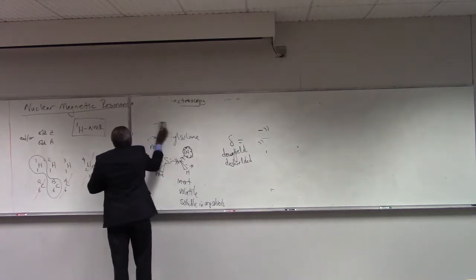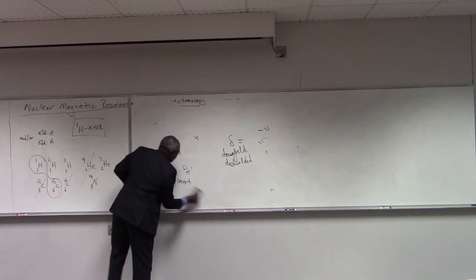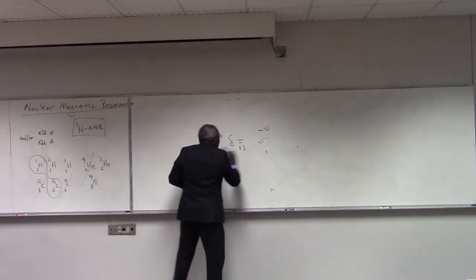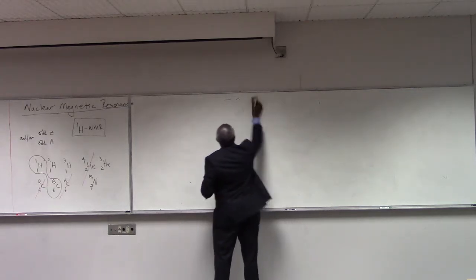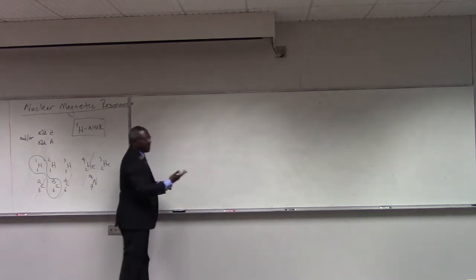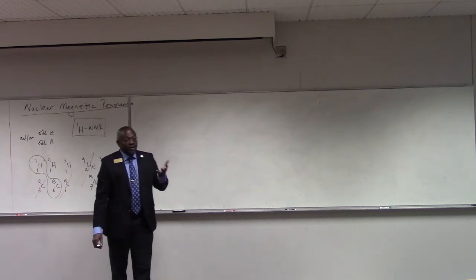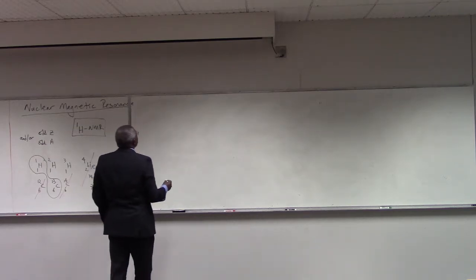So when we look at an NMR spectrum, we look for four things, although I will mention all four. For the purpose of this course, which is Introductory Organic, we will only highlight three. The fourth one is not of major use in intro-organic chemistry. For a graduate course or an upper level organic chemistry course, it would be of value.